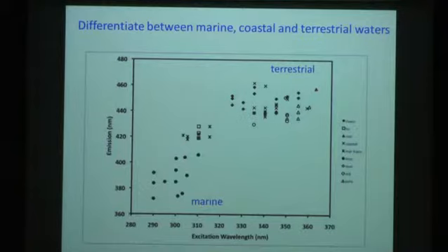These are estuarine samples, and these are marine samples, especially ones that were taken where there was high productivity. So we could discriminate the kind of environment that the water sample came from just from doing this little simple scan. It now takes 5 minutes to do these. It used to take me 2 hours.